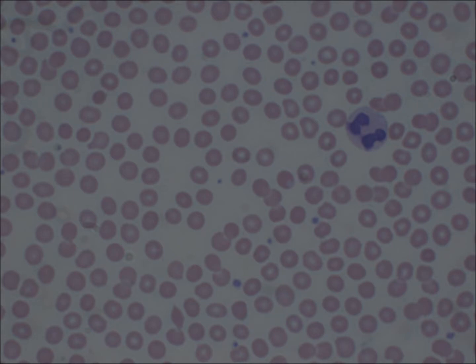Let's look at this image — I want to point out a problem with reading platelets. Sometimes during staining they get washed out and look more like a parasite than a platelet. I'm going to circle in red a platelet that looks a lot like a potential parasite. Notice it doesn't have the same coloring as the other platelets circled in black. You've got to be aware that sometimes colors and shape don't always fit exactly what you want them to look like textbook. Experience and looking at as many of these as possible helps to solidify identifying what these pathogens are.